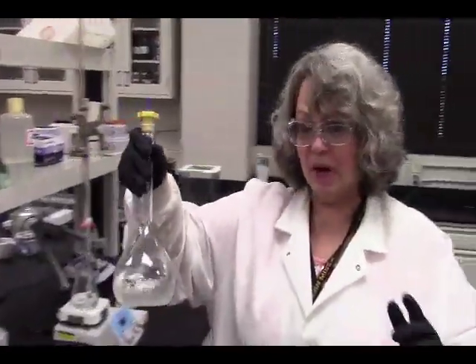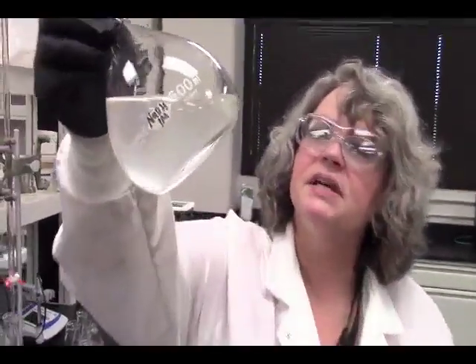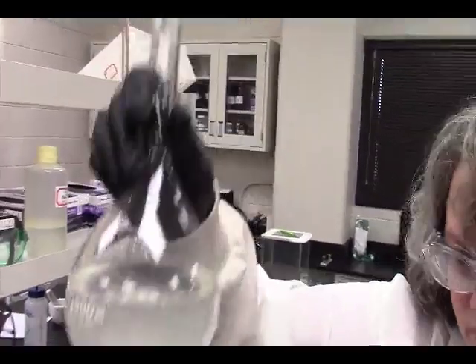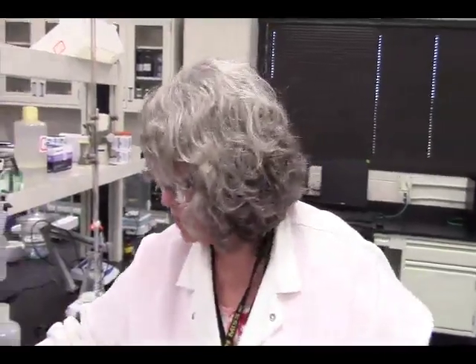Bobby and I, mainly Bobby, made up our vitamin C stock as per the instructions in the lab. So we got the mass of a whole tablet, crushed it up with a mortar and pestle, and delivered 0.5 grams into our 500 milliliter flask. You'll notice that all of this didn't go in solution because all pills that you take contain caking agents that are not going to be soluble in here. They will, however, be soluble in your stomach conditions because it's acidic, and these are mainly carbonates and such, so they'll react with your stomach acid. All right, so no worries in your system.